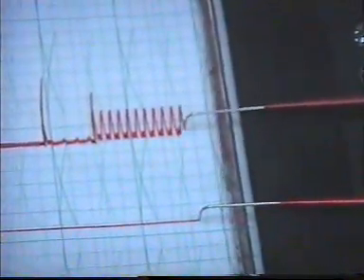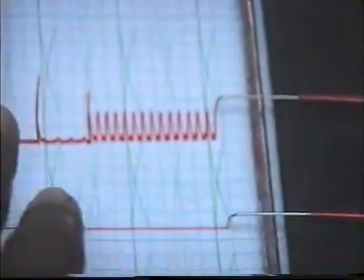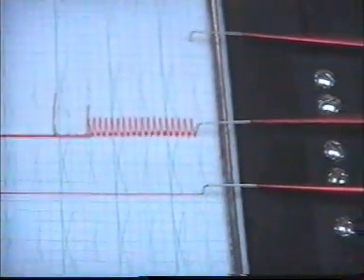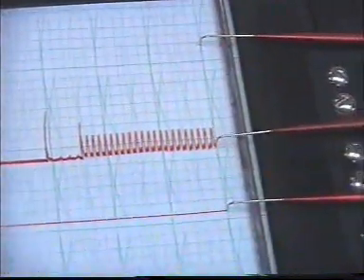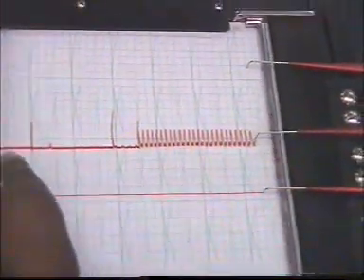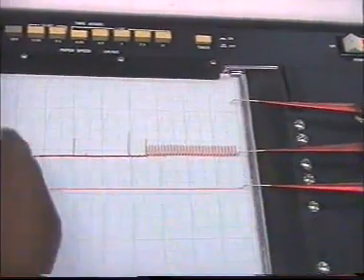We add atropine to stop the effect of acetylcholine, and the heart again resumes beating very fast. So the atropine antagonized the effect of acetylcholine. Acetylcholine stopped the heart, maybe because we added an overdose of acetylcholine, but now it again resumes beating as normal.